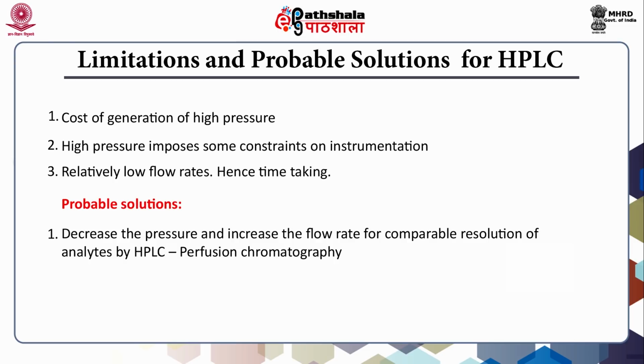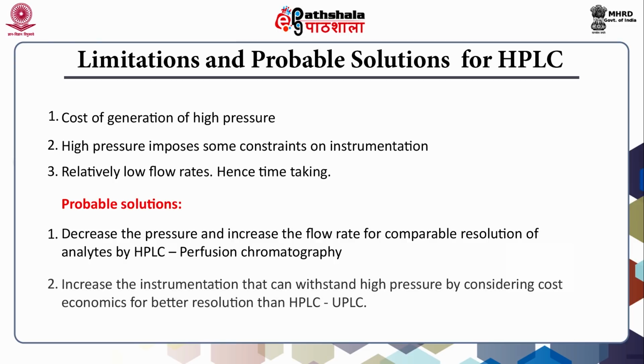Another solution for these limitations is using instrumentation that can withstand high pressure, considering cost economics, for better resolution than HPLC. One of the alternatives for this is UPLC, and this is another alternative format of HPLC.